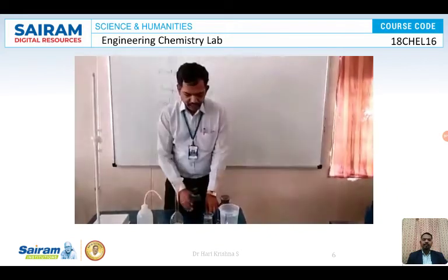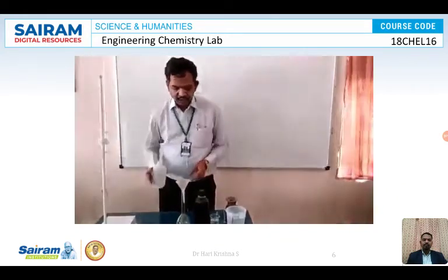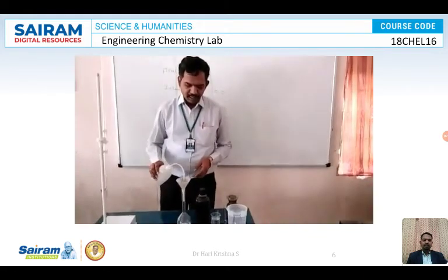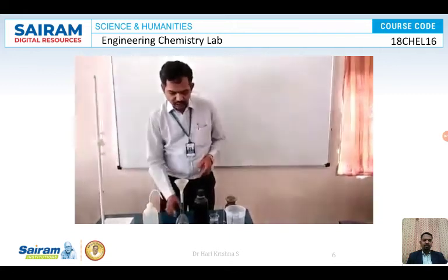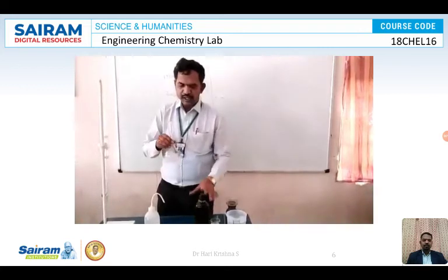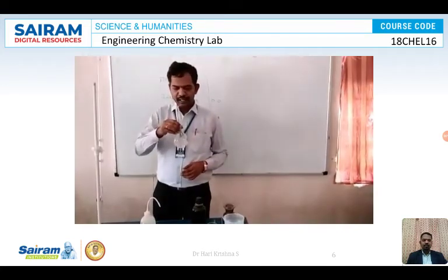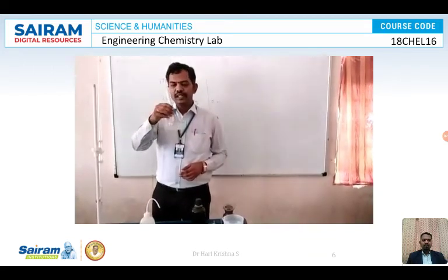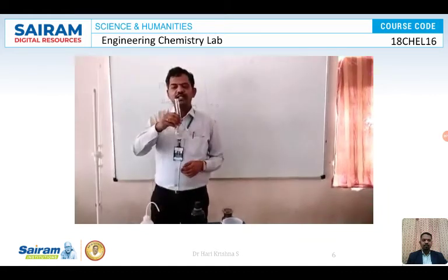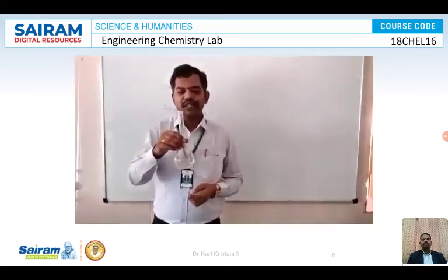Once you add Na2EDTA to this, it will be weighed again to know the amount of salt taken. Then we are going to add a little amount of water to wash down the crystals into the volumetric flask. Once the crystals are washed down, we are going to dissolve them. Let us swirl the bottle so that the crystals are completely dissolved. Okay, this is called swirling. When the crystals are completely dissolved, we are going to add distilled water up to the mark here and make up the solution up to the mark.